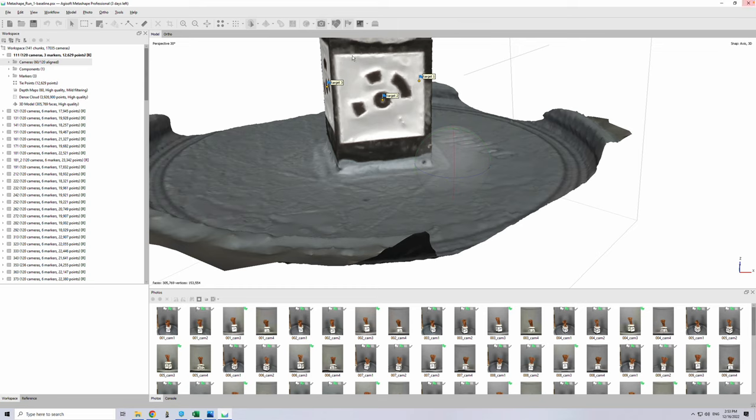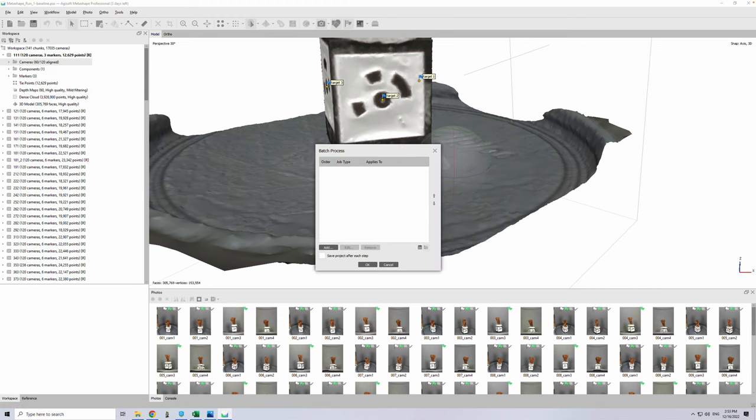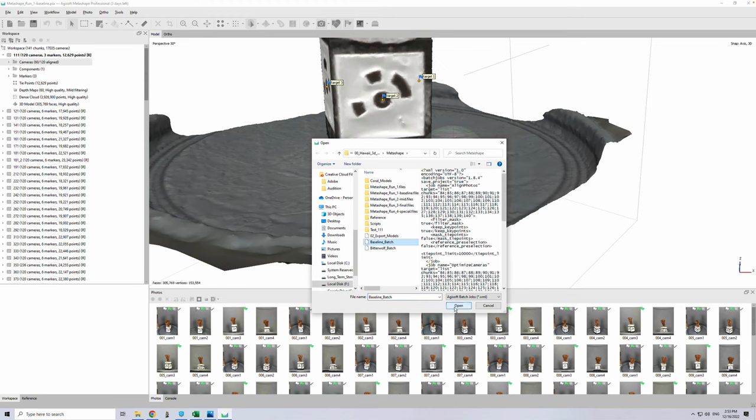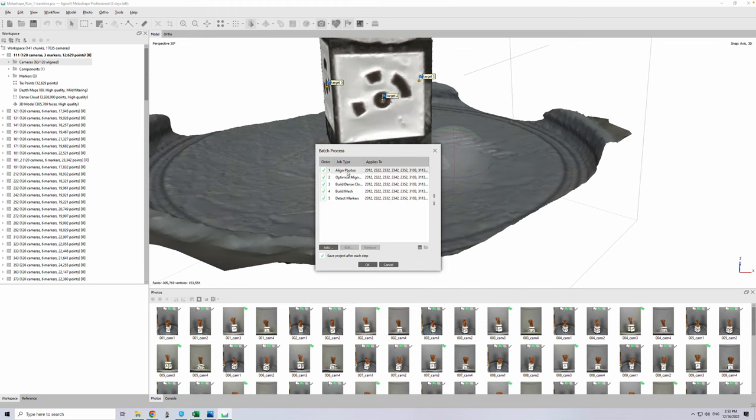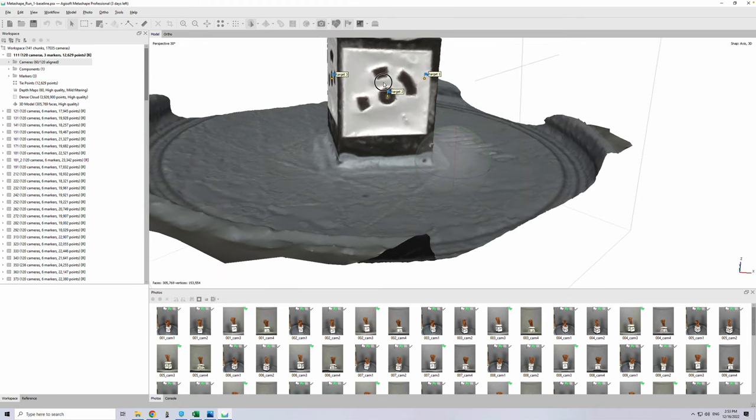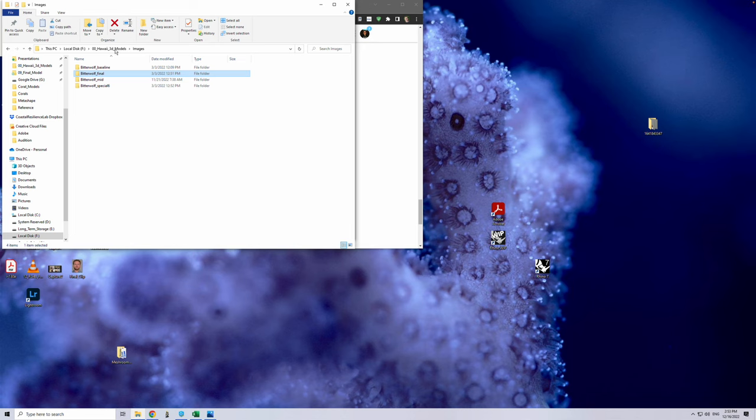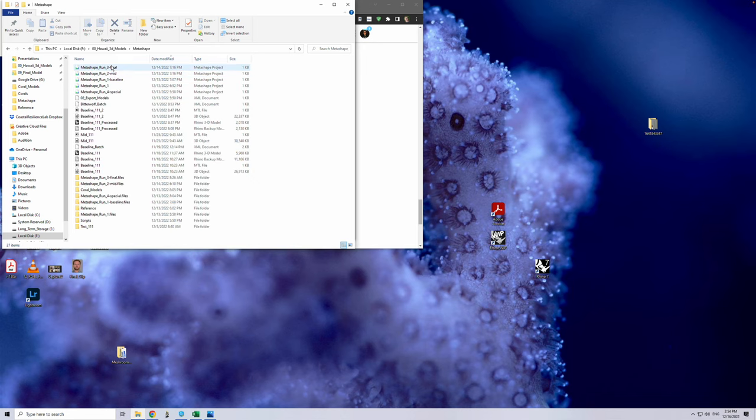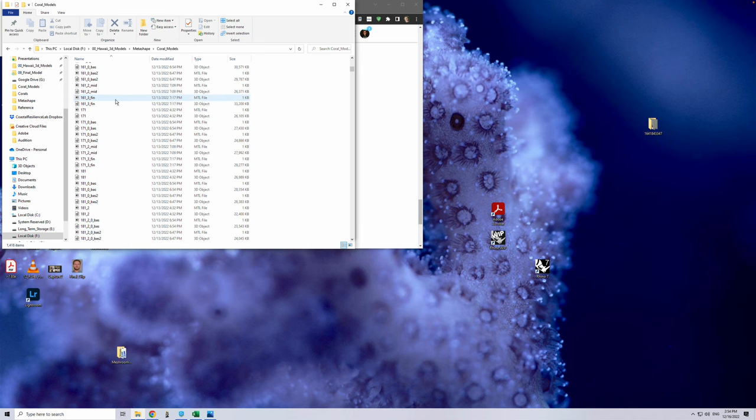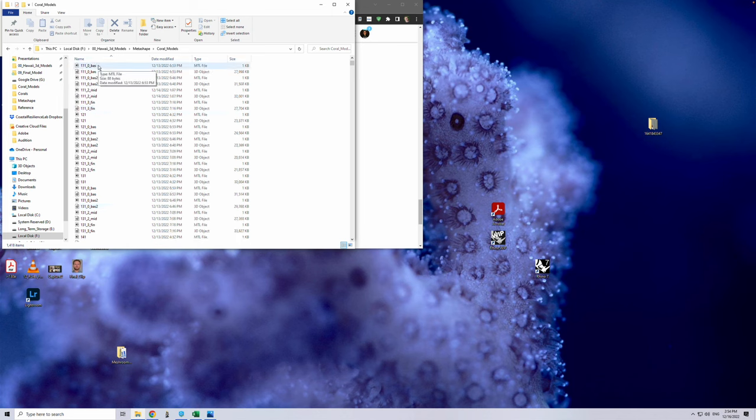This can all be done in a batch process. We would load the XML file that's going to be doing all of the batches. It's going to align the photos, after that optimize the alignment, build a dense cloud, build the meshes, detect those markers, and then I created a custom script to automatically put the reference location of those markers in and save that information. After that's done, the models are exported onto the computer and are saved in a location called Coral Models. We have all of these different coral models with different numbers representing the unique identifier of that coral, and we can then process these.